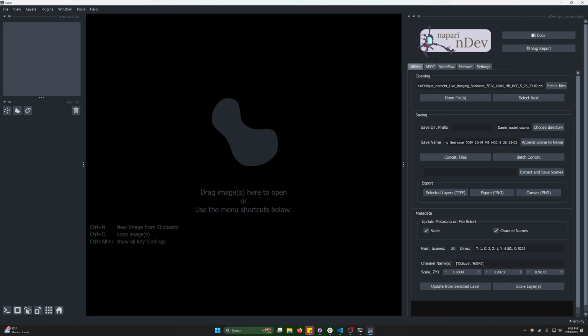Because I don't have any information in here, it's just going to do all of the scenes, and it's going to propagate this metadata onto it. So when I do that, we're just going to have to wait a moment as it's going to be spitting out all these scenes. Soon this will be multi-threaded so that if we click right now, it's going to look like Napari is broken. You just have to wait a moment. But soon it'll be multi-threaded, and it'll smoothly run and update as we go. We're just going to wait a moment.